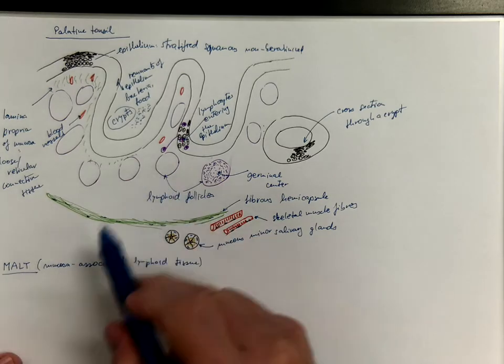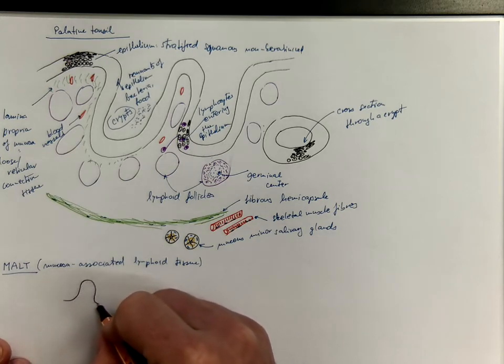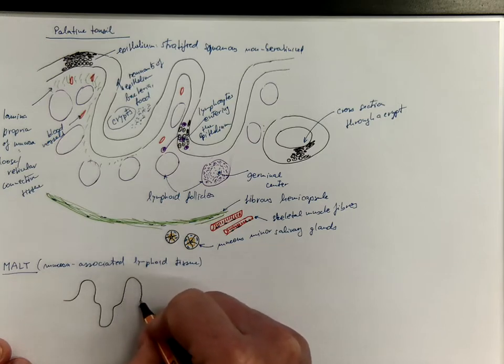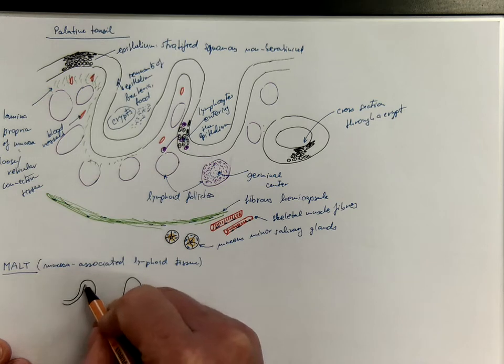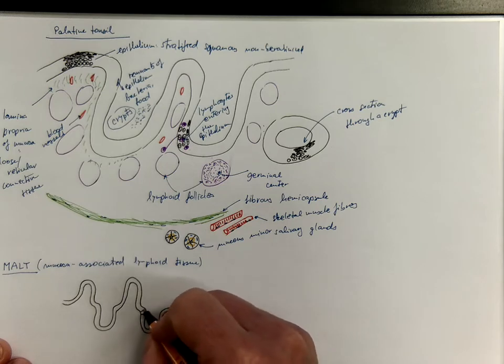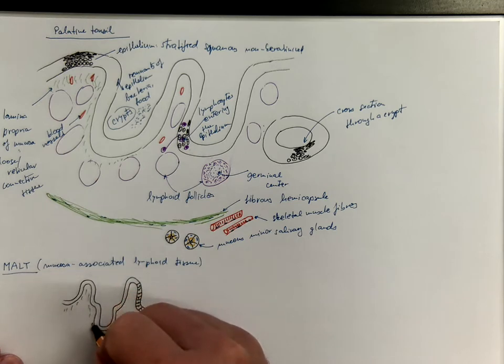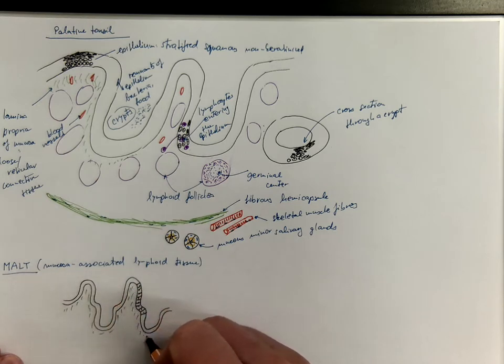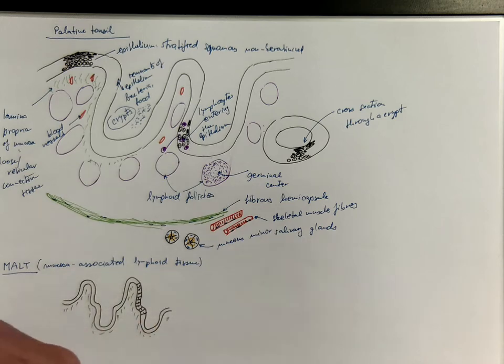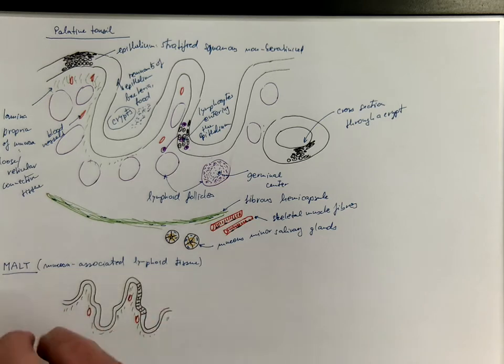Let's have another example of MALT from the intestinal, let us say from the distal ileum, where you have the villi, intestinal villi and crypts, with a simple columnar epithelium. We got the lamina propria of the mucosa, that's the loose connective tissue with blood and lymph vessels, and we got the lamina muscularis of the mucosa.